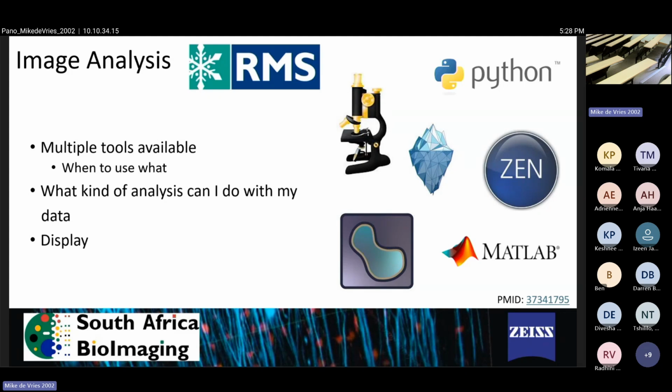And they share, or if someone has an issue, we do it on Teams, and they just upload in advance. Here's a 100 megabyte image. I'm trying to count this, and I've no idea how to do it. And the others would have a look, and they would swap notes. So you could build a community, whether you do it once a month, once every 3 months. It could be very low effort, but whoever's the best guy in ImageJ in your place, get him into that group.